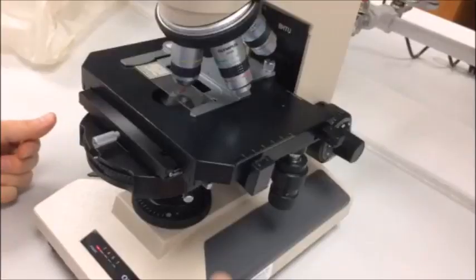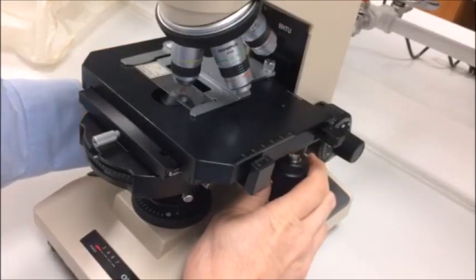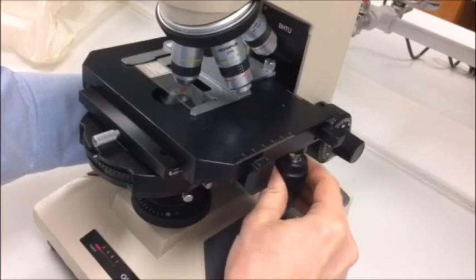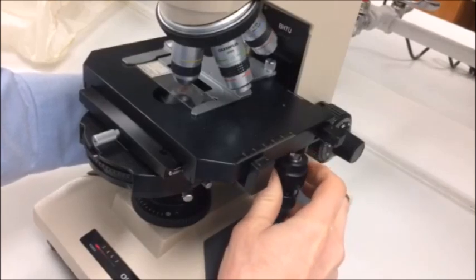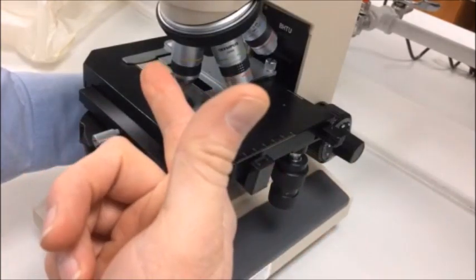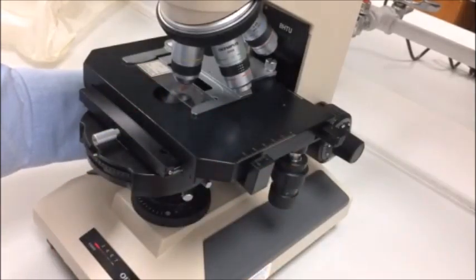One trick that I sometimes do in order to focus on the specimen is to actually sort of wiggle the mechanical stage as I'm focusing. One of the problems is that sometimes you're focused in on something other than the object, like maybe dust on the top of the condenser or whatever.